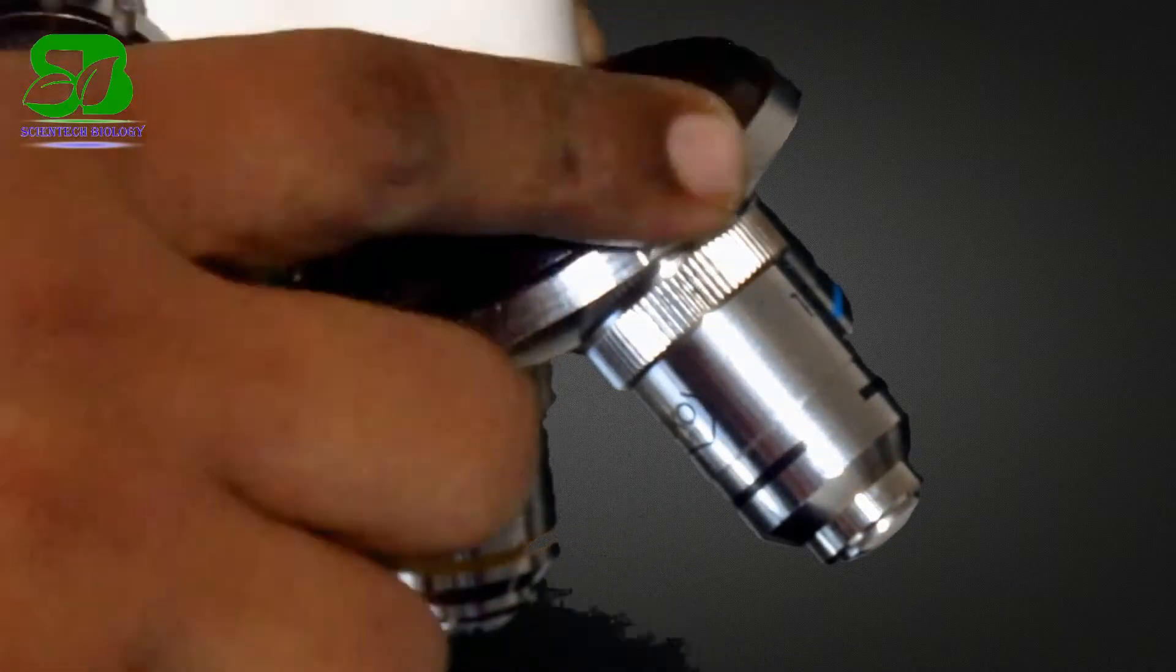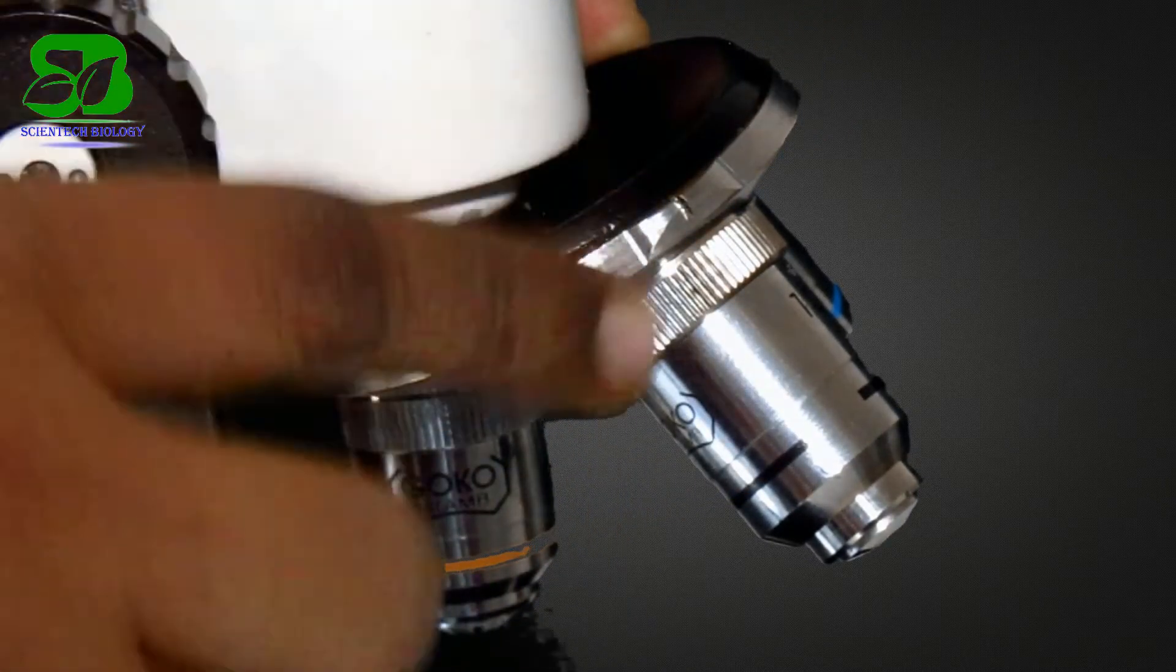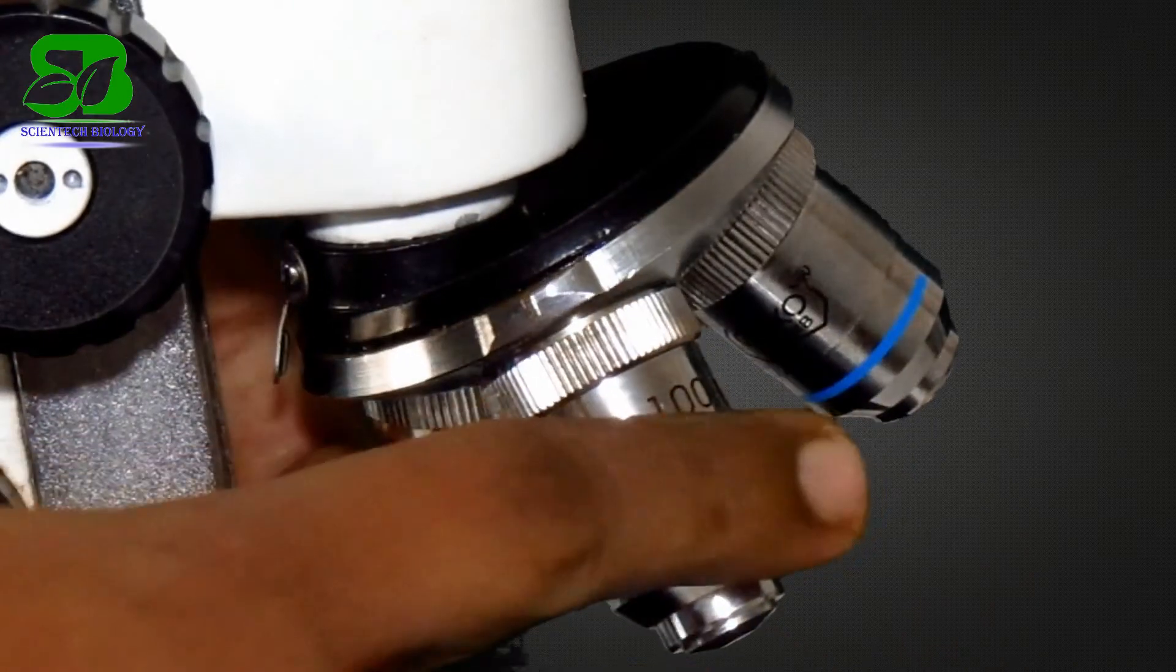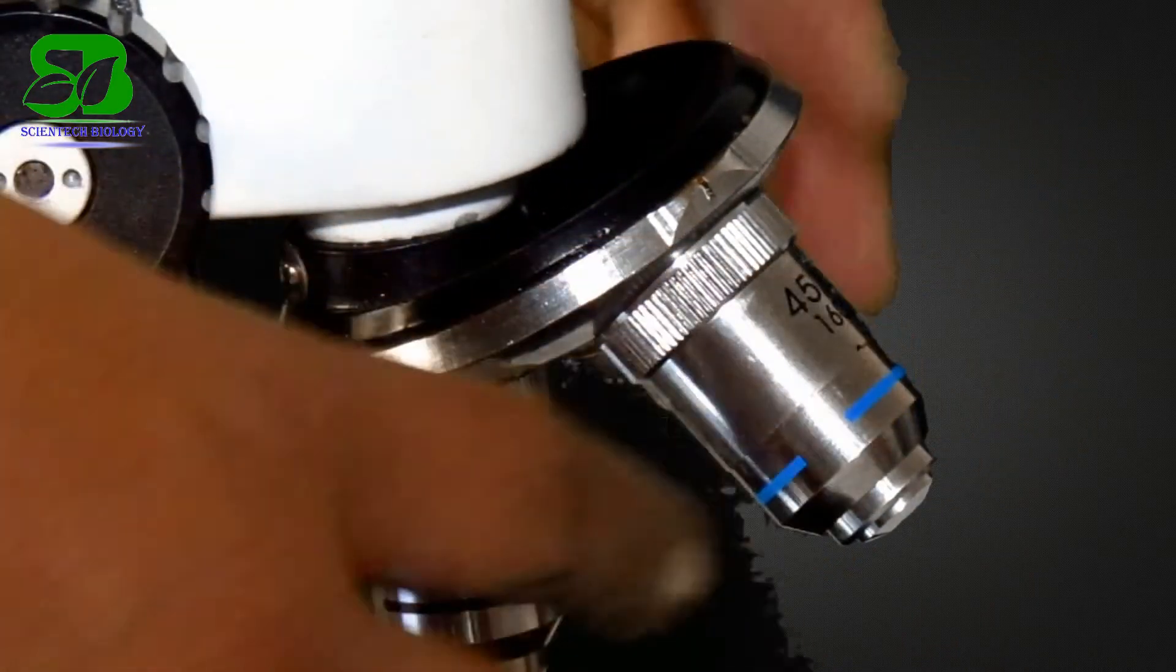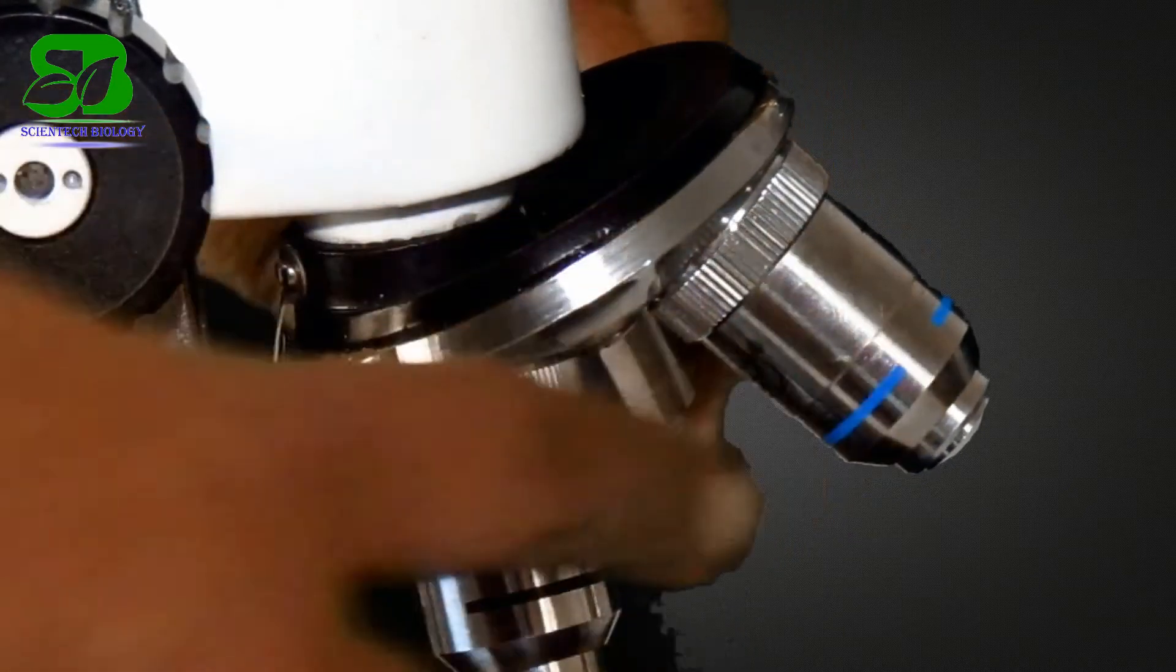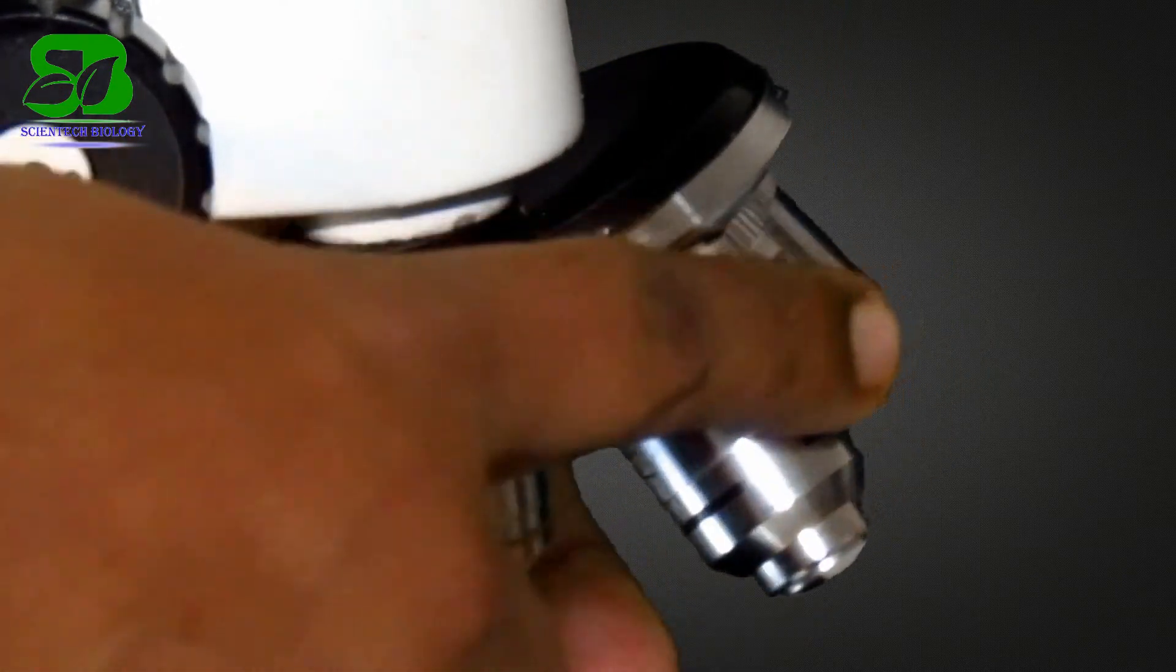This part of the microscope is the nosepiece and it holds the objective lenses. You can rotate it to easily change the power of lens. Here you will find 3 or 4 objective lenses. They typically consist of 10x, 45x, or 100x power.